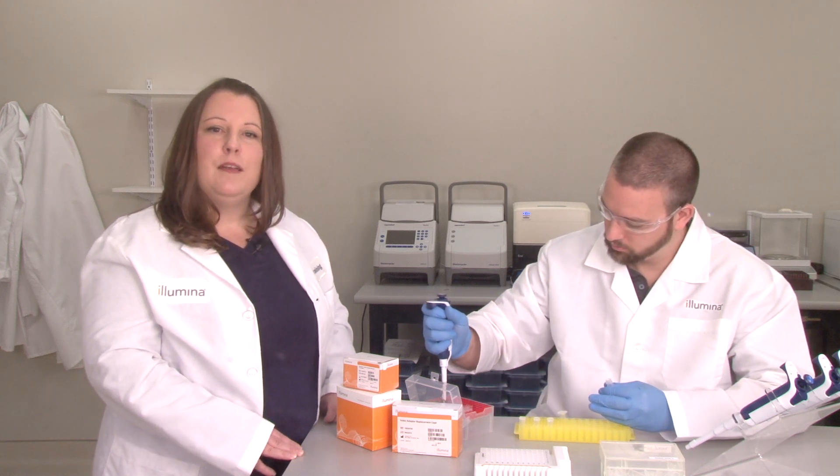The NextTera library preparation kits provide a fast and simple workflow utilizing a modified transposon for cleaving and tagging DNA. The resulting libraries are compatible with all Illumina sequencing systems.